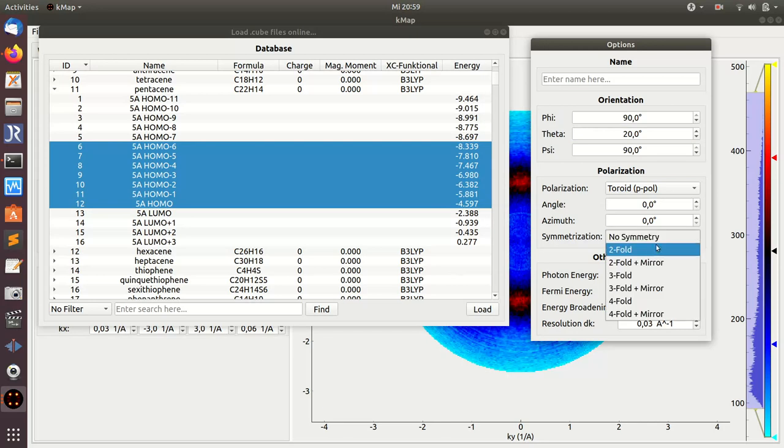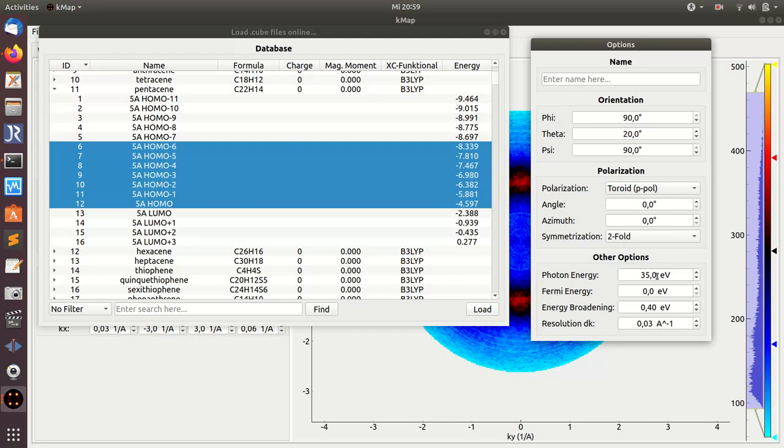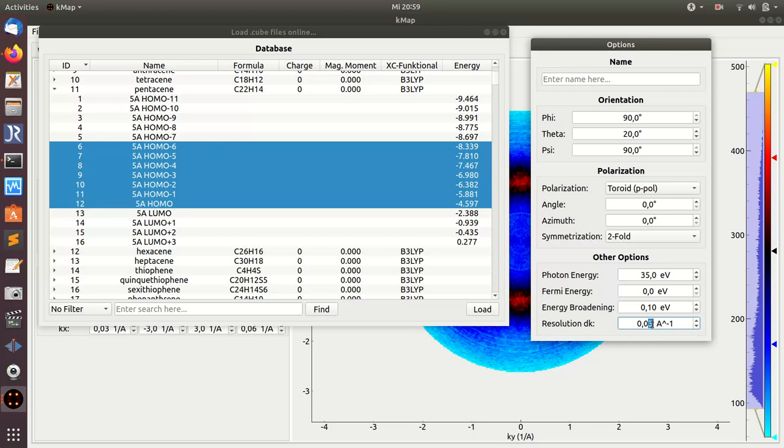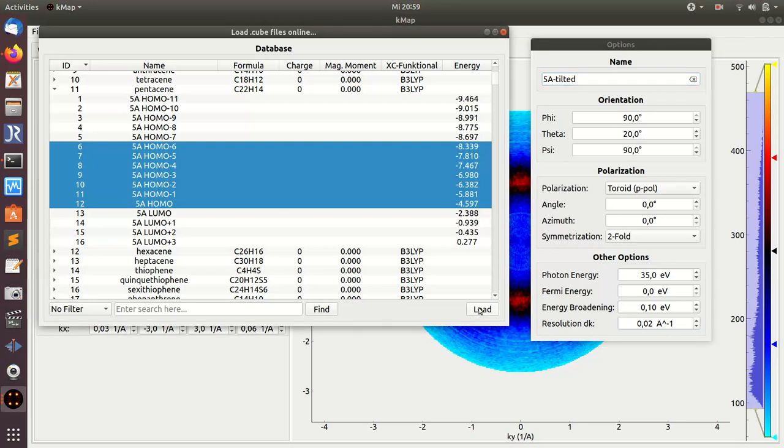Also apply a polarization factor, apply a two-fold symmetry. I have a photon energy of 35 eV, a certain broadening. This is important now: the energy broadening means that each of those orbitals is broadened with a Gaussian broadening of 0.1 eV. And I want my desired resolution in k-space to be 0.02 inverse angstroms. I can give a name to this, so I call it 5A tilted because I tilt it by 20 degrees. And then I load the data.